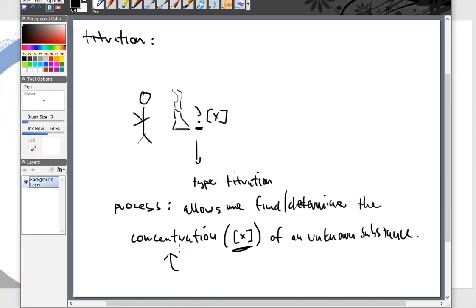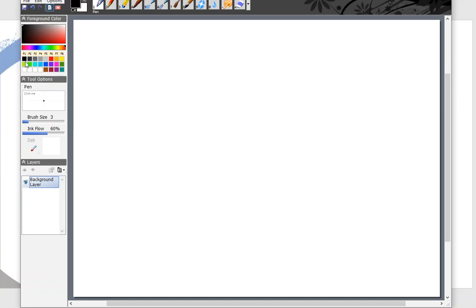Is there too little? That's the power of a titration, and that's why we use it most of the time. Now, we're going to go back to the very first part of our semester together. In the very first part of the semester, we talked about this thing called a burette. The burette is going to be brought into the laboratory, and this is what is used in a titration. So we're going to whip out those burettes just like we did in the very beginning of the semester.